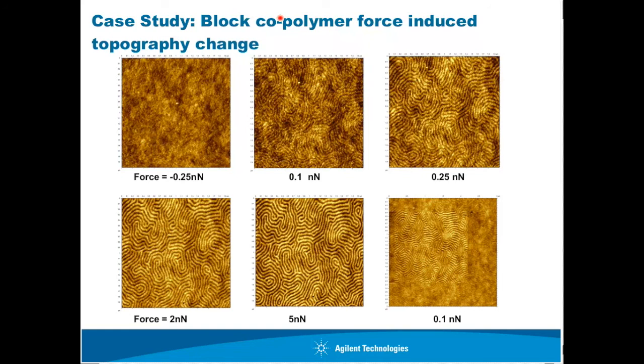As you fix your drive and set point, you can do an amplitude versus distance curve and analyze that curve. We could get the actual force when you use different drive and set point. I've done that once, but haven't put together a presentation yet. If you really want to know it, we could cover it in a future topic.